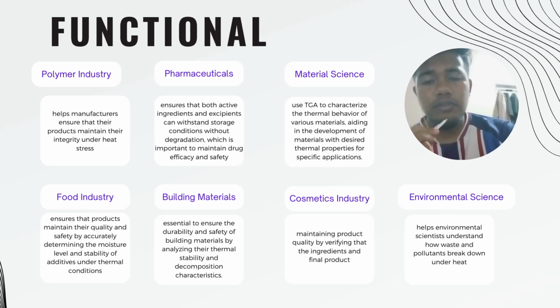Okay, we go to the functions of TGA, for the first, polymer industry. In the polymer industry, TGA can help manufacturers ensure that their products maintain their integrity under heat stress. By analyzing temperature and decomposition patterns, it helps in optimizing formulations to improve performance and durability.